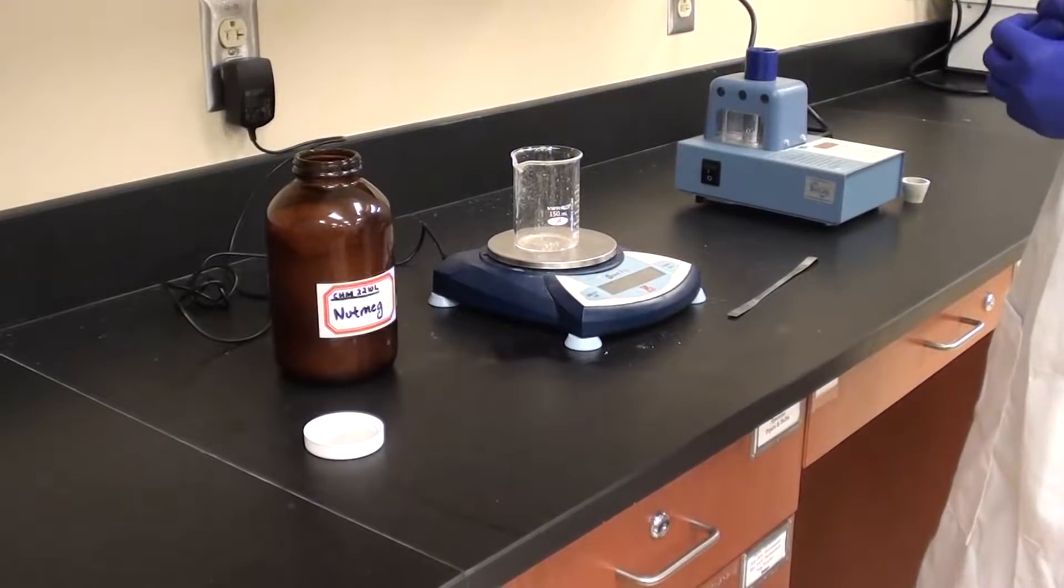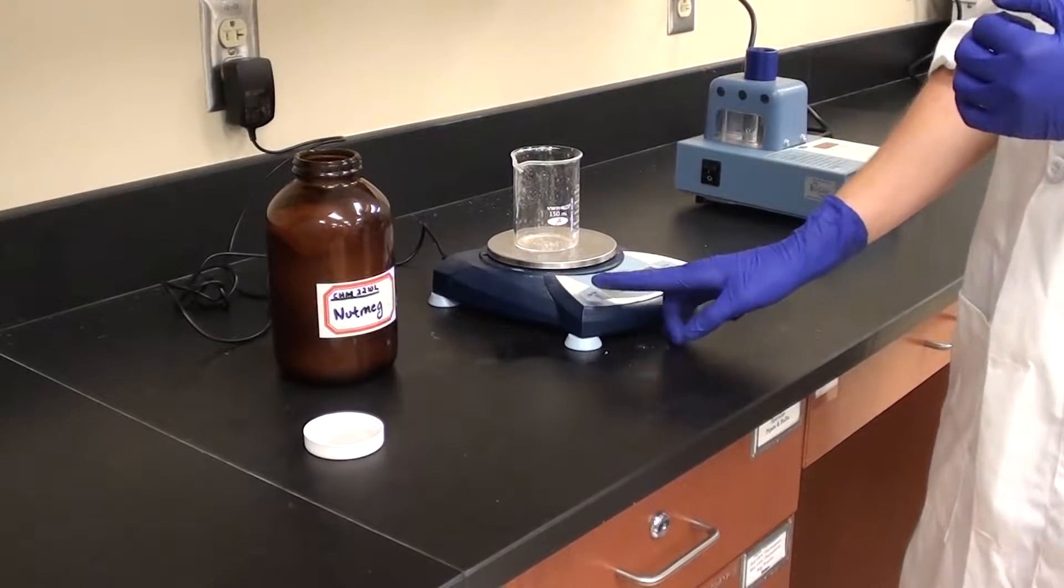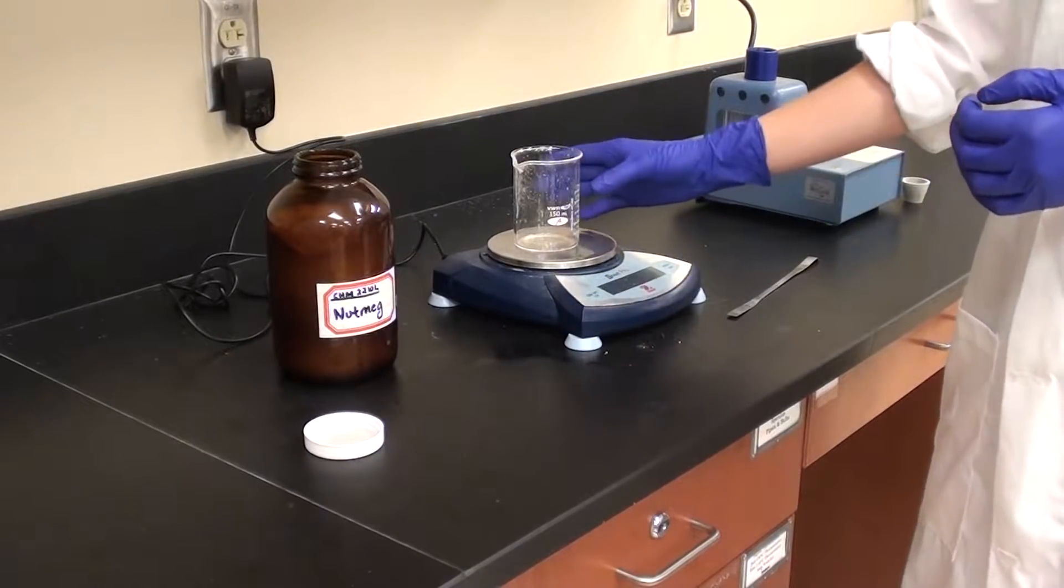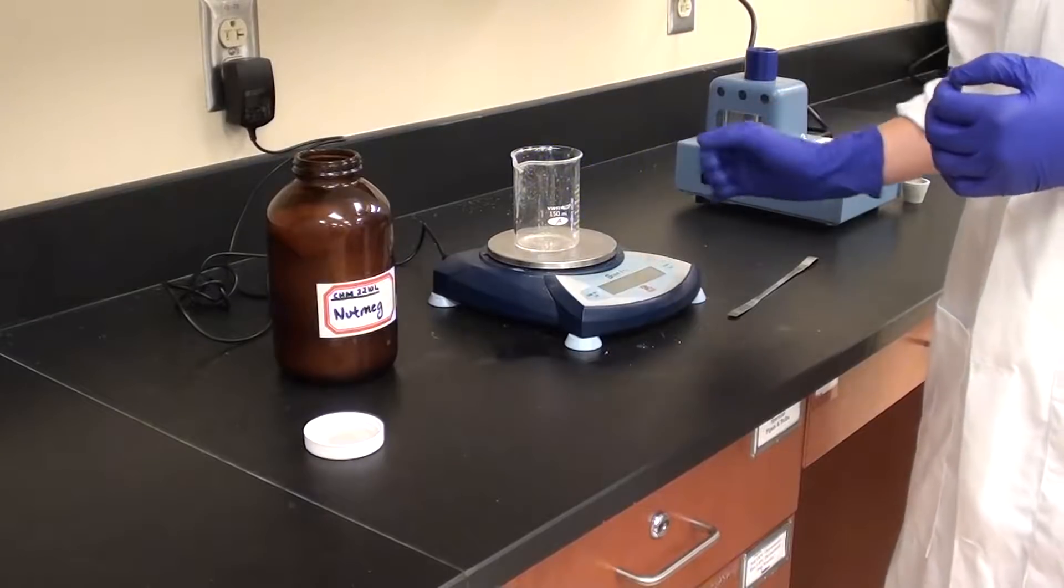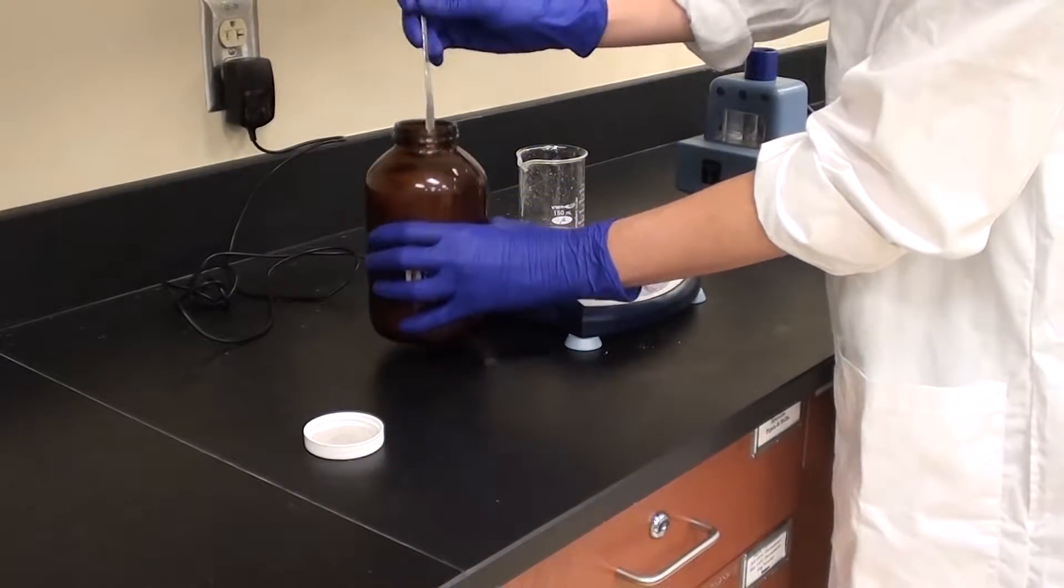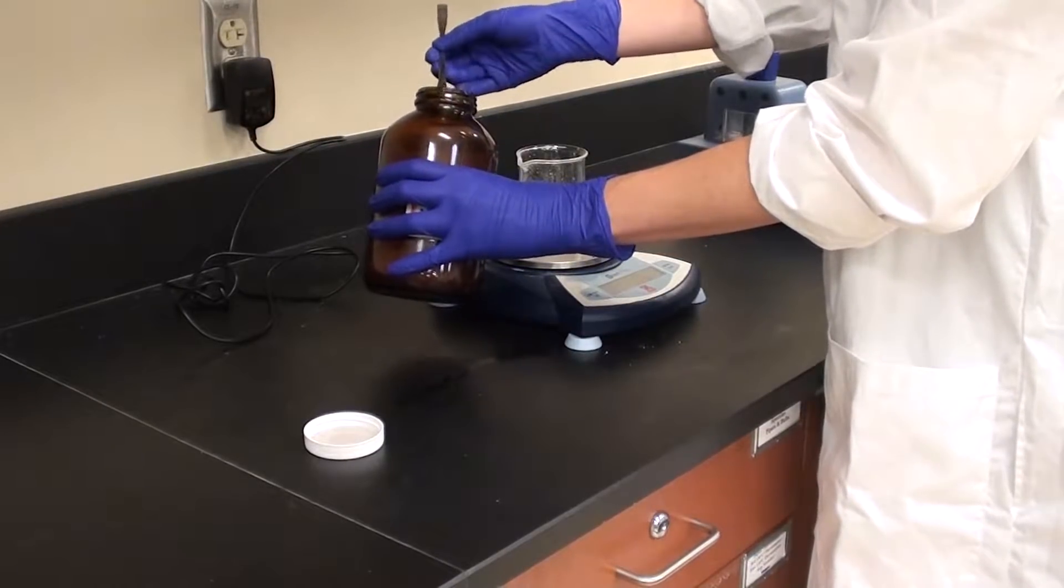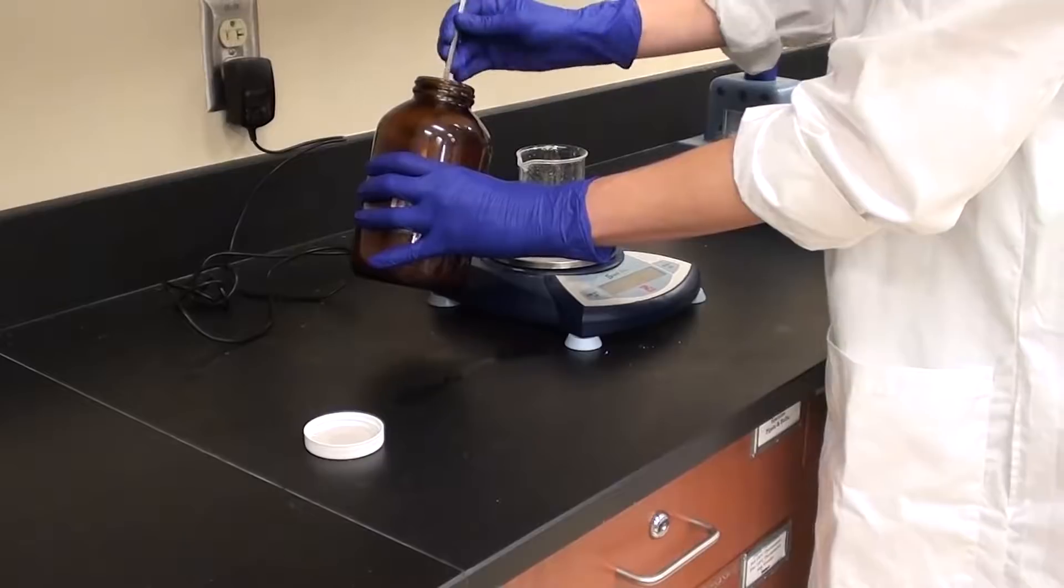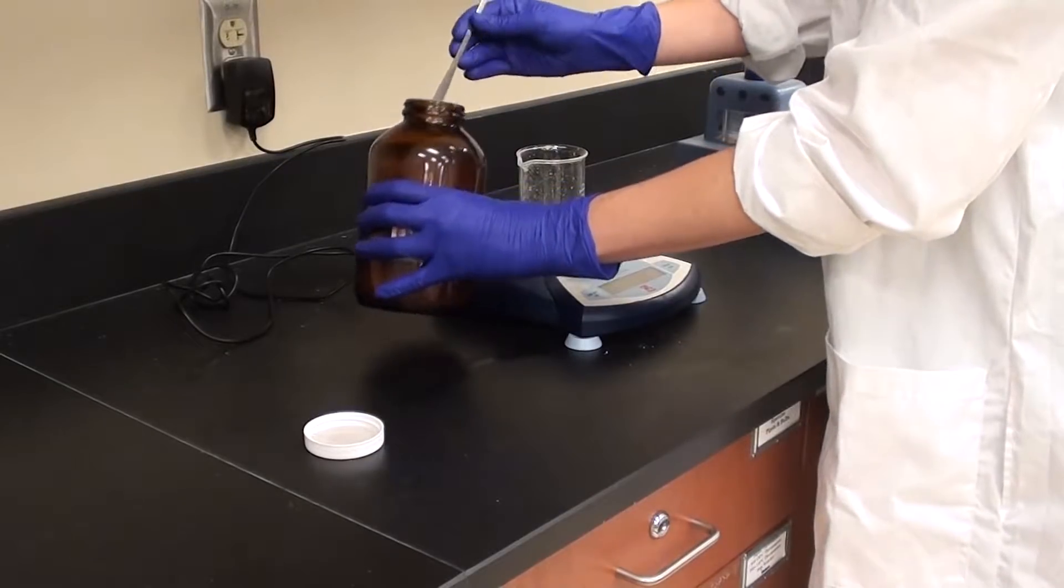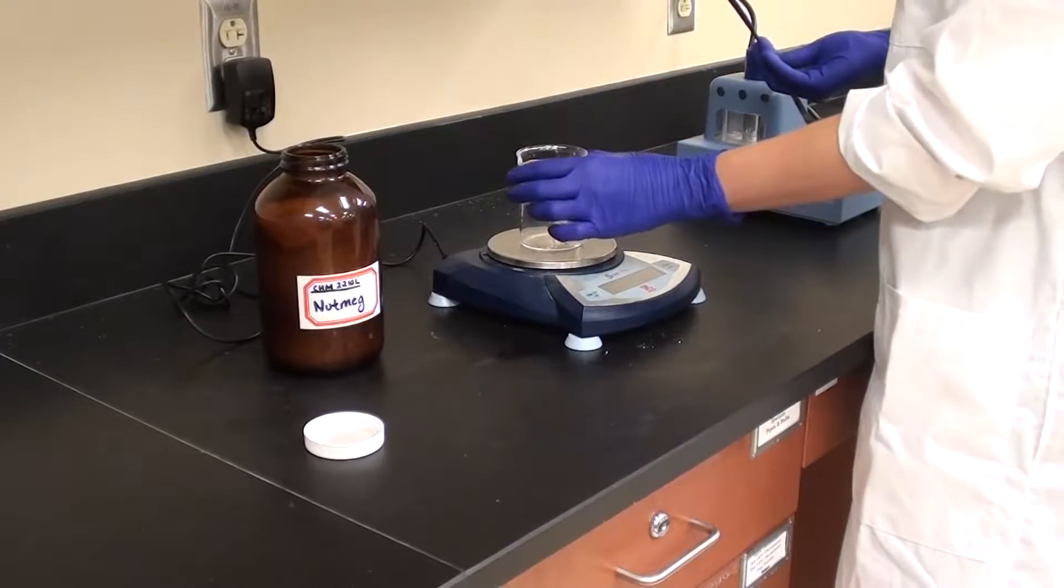Kristin is weighing out the nutmeg. She's going to tare the beaker there. Now what she isn't going to do is pretend to do what you shouldn't do. This is what we don't want to see - we don't want to see the nutmeg being added while it's on the balance, because that's going to damage the balance. Stuff's going to end up on the balance and underneath the pan.